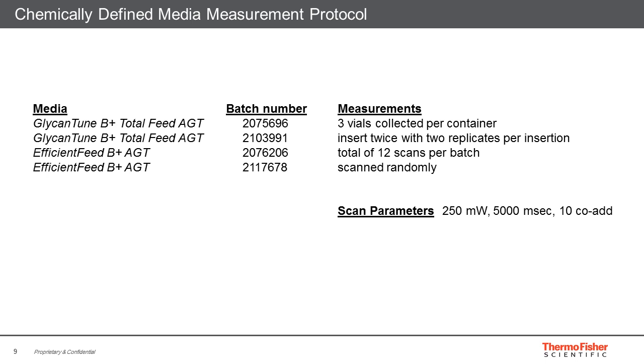In total, 12 scans are collected per batch of media, and we also see the scan parameters that were chosen using TrueTools' method setup option. 250 milliwatts laser power, so high-powered laser, 5,000 millisecond exposure time, so 5 seconds, and 10 coadds per analysis.